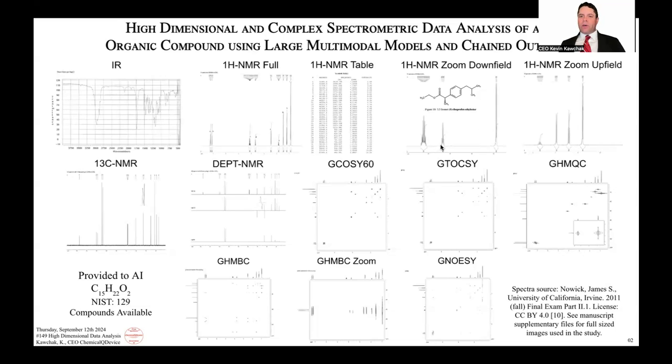As far as some of these other ones, more downfield, this quartet specifically would be next to the CH3 on the chiral carbon here. And then going further upfield, the septet, seen as the CH. And for part B of this specific manuscript, the original 3.5 Sonnet group did not have an isopropyl group. This looks clearly like a septet, one hydrogen, and then this last one at 0.89, definitely integrating to 6, being the dimethyls of the isopropyl group. And then we see some of these other CH3s showing up as well. So this all checked out as far as this was the compound that the AI model gave to me in this first row.